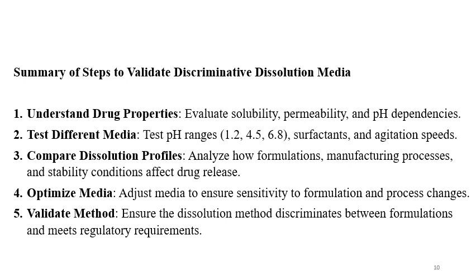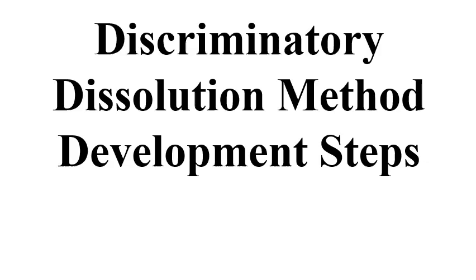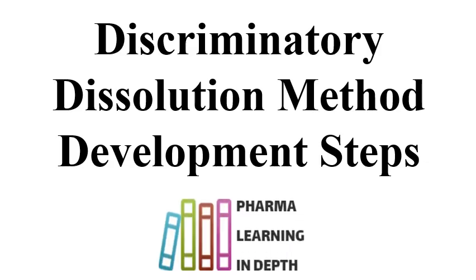Also, one point I want to mention here is that we need to select the apparatus also. So based on the formulation, suitable apparatus is required to be selected, like basket apparatus, paddle apparatus, or USP-3 apparatus or USP-4 apparatus. Then optimize the media, adjust the media to ensure sensitivity of formulation and the process changes onto the dissolution results. Validate the method. Ensure the dissolution method discriminates between the formulations and meets the regulatory requirements. So this was the information for discriminatory dissolution method.